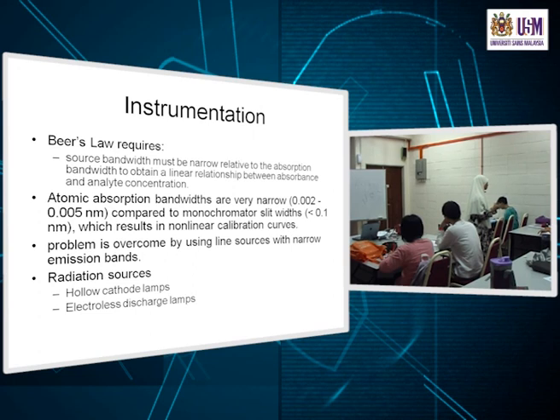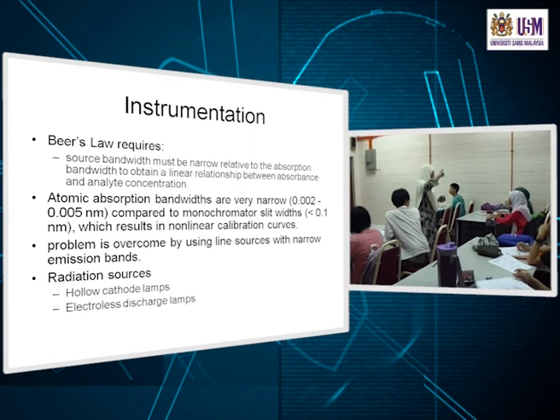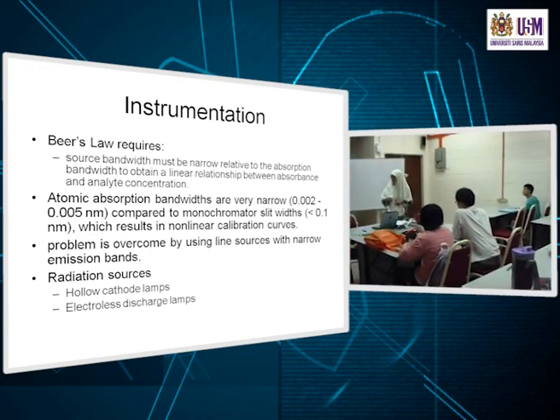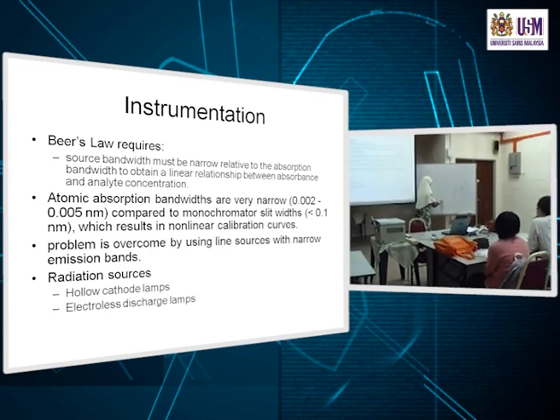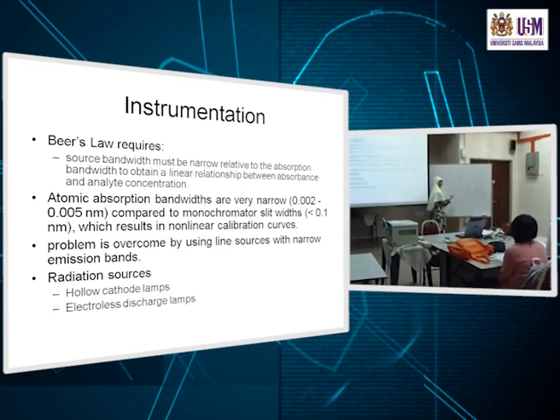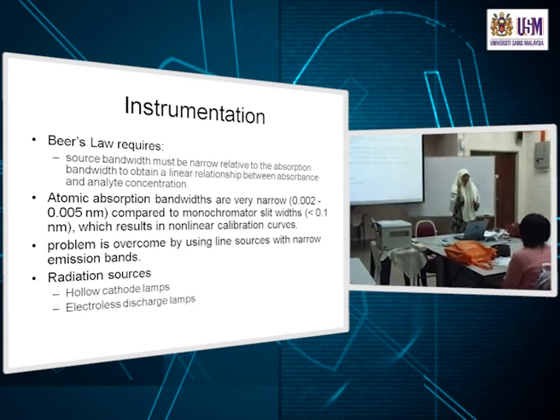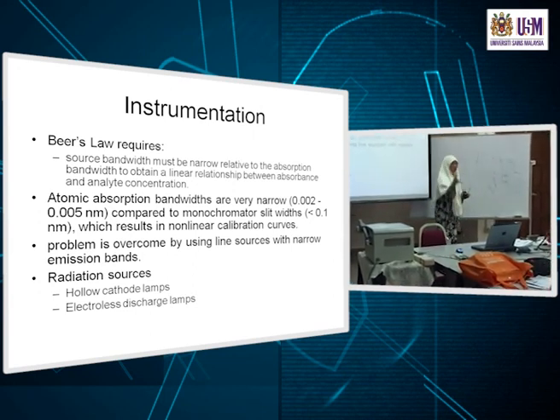The peak at the half. Okay? What is it we're measuring? The width, the range of wavelength at half the peak height. Remember? Anytime you talk about bandwidth, you're talking about some spectrum here. So now when you talk about source bandwidth, you're looking at the radiation, light at a certain frequency coming from the source, okay?